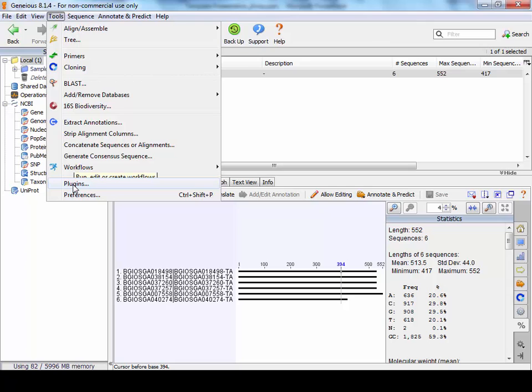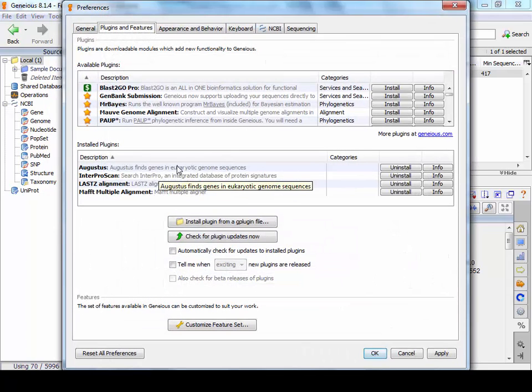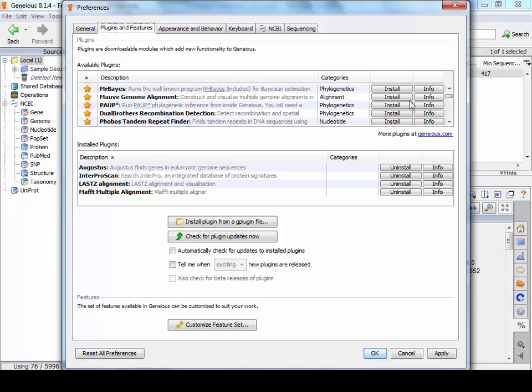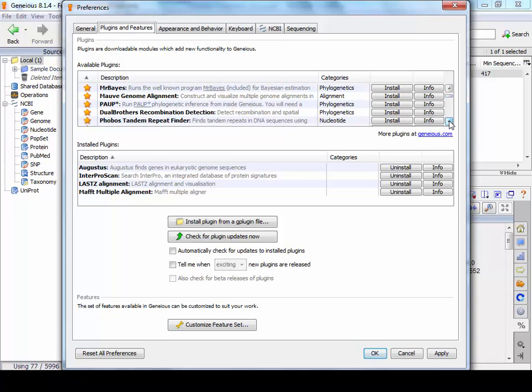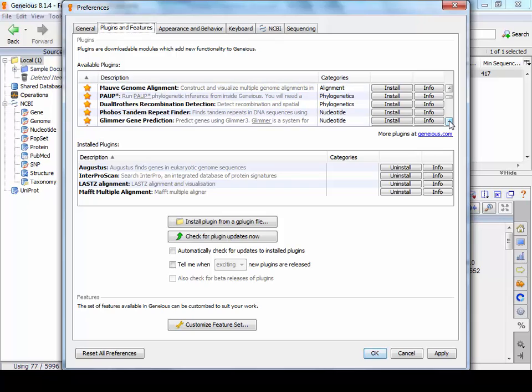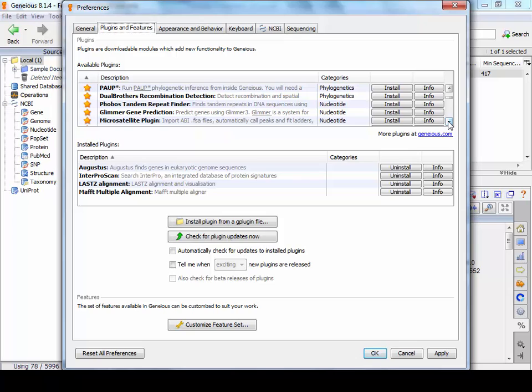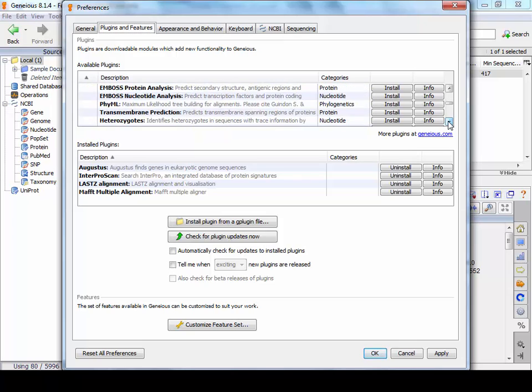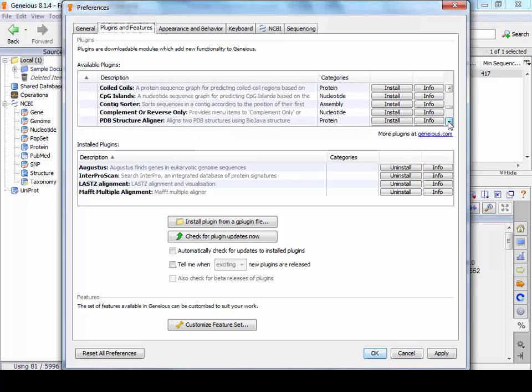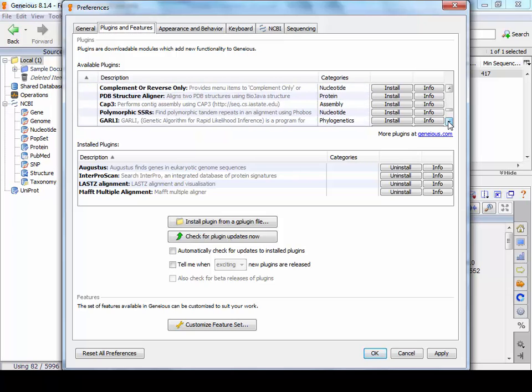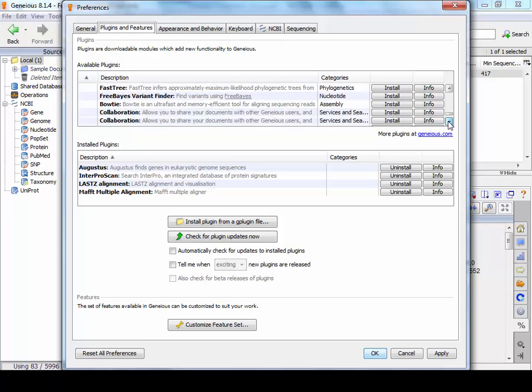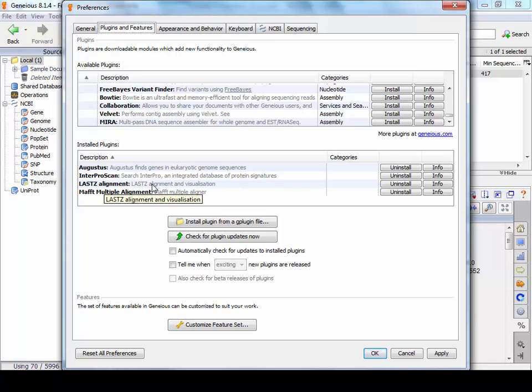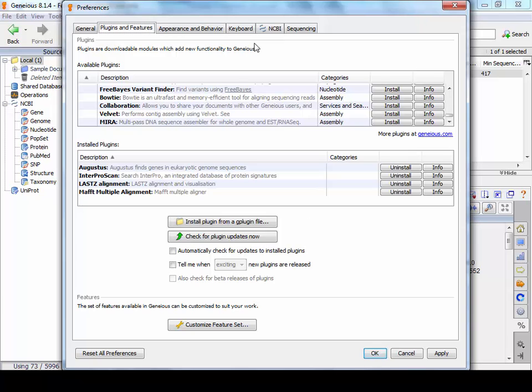An important one to look at is plugins. So there's a number of plugins you can install and use. Mauve is a very good genome alignment tool. It would be beneficial to install that. Phobos is very good for repeat finding. And there's a number of other tools in here that may be useful to you. One additional that I do recommend is Interpro Scan for looking for protein domains. We've also got Last is a very good alignment program as well. So there's a number of tools there to play around with.